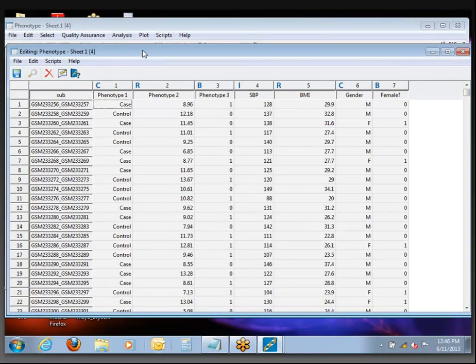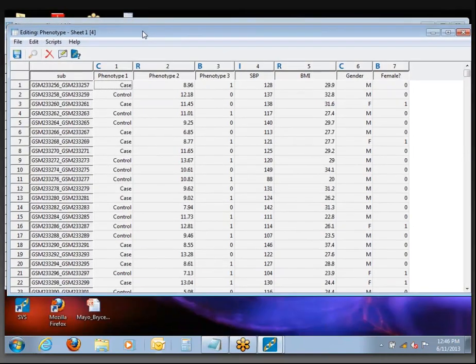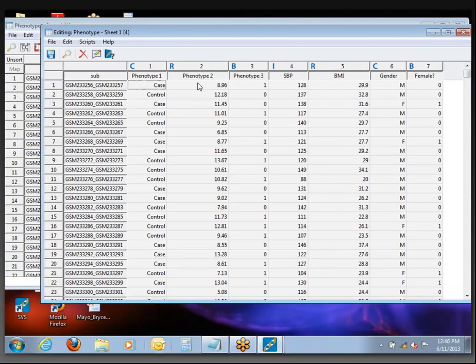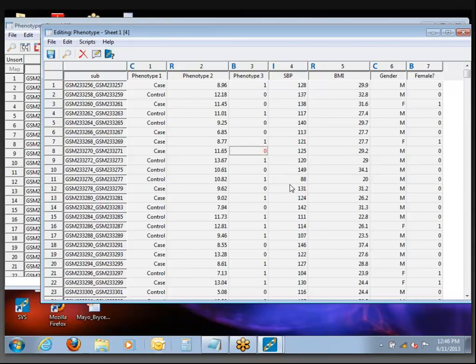In the Editor mode, there are a number of different things you can do. If you simply pick a cell and click on it and change the value, you can. You'll notice that the value you've changed is highlighted in red — we keep track of all of your changes, and nothing is permanent until you click the Save button.